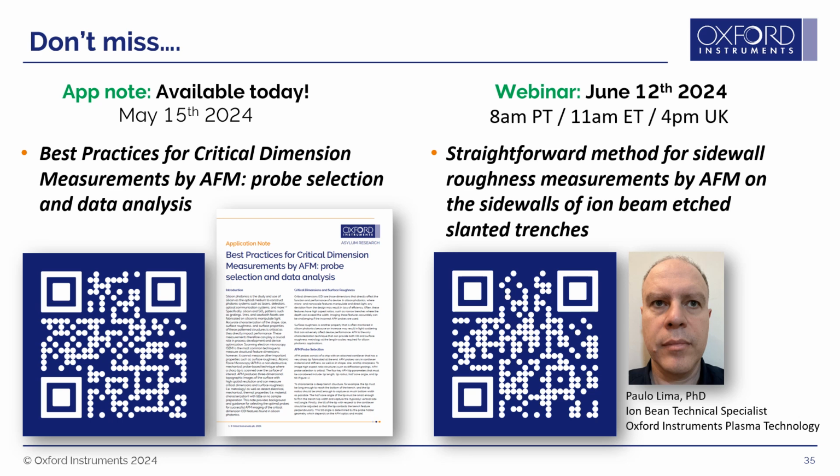Whereas with AFM, it's the AFM tip, the AFM probe, that touches the surface physically. So it touches the top surface, the bottom surface, and we obtain the difference in those different surfaces, and this is done by a sensor. So there's much less user interpretation, or user input, when acquiring the data. So I think the data that you're seeing in SEM is good data. However, it might be underestimated in some instances.